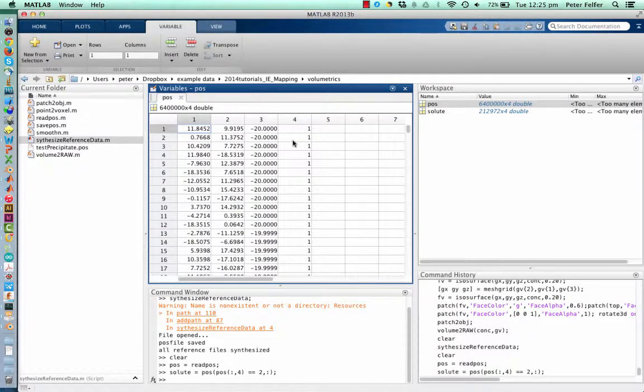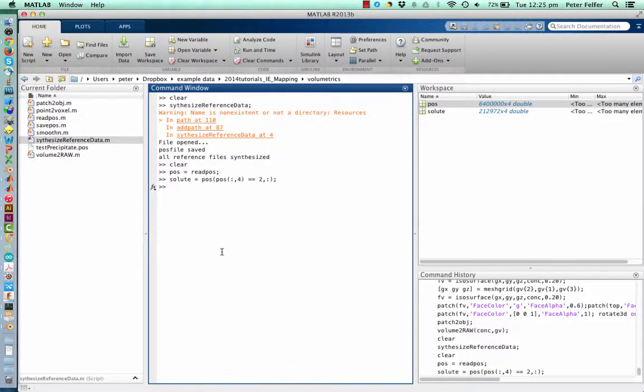If this were real data, it would be values like 27 point something, 40 point something, whatever your mass-to-charge is. Anyway, we don't need that for now. And we also need the bulk. The bulk has a fake mass-to-charge of 1, as you've just seen in the variable.